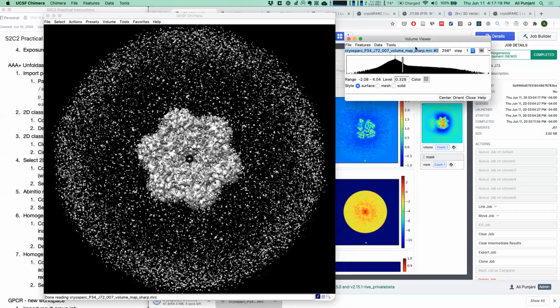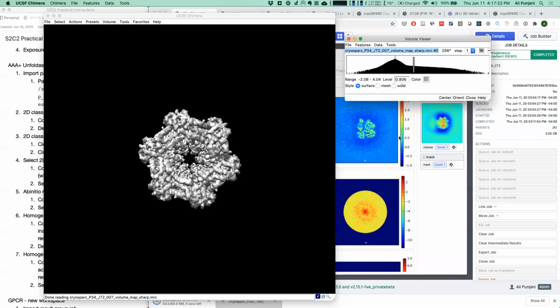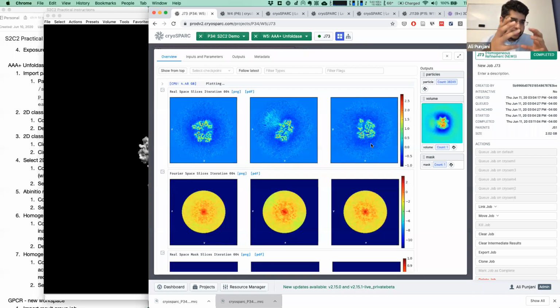Just a point of clarification. Can you please clarify between the inactive and active states, which ones you're referring to? Like which one is which? Sure, so the inactive state is the state where the molecule is by itself, a single molecule, and it's fully symmetric. That's the inactive state. The active state is the one where the molecule has a second molecule attached to it in the process of unfolding that second molecule, and it's asymmetric.